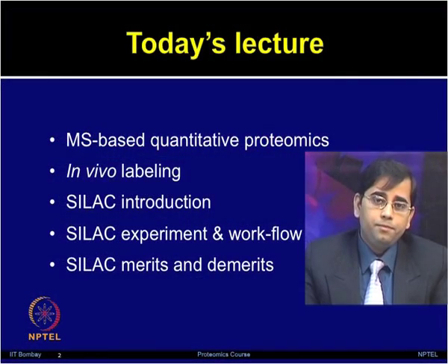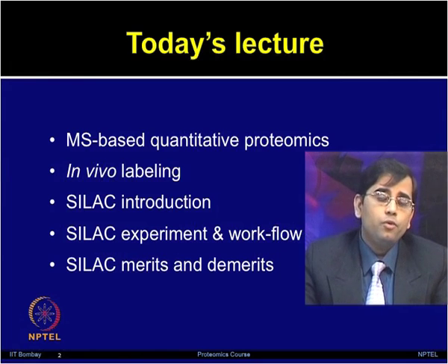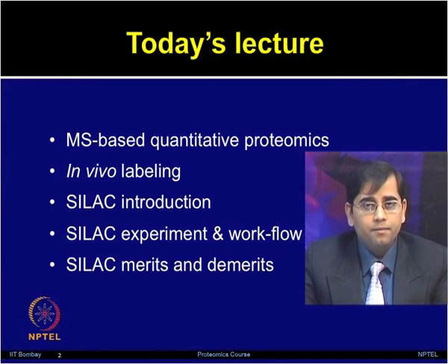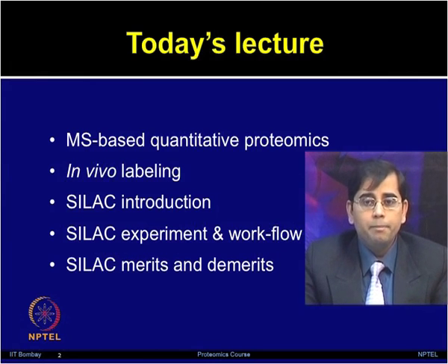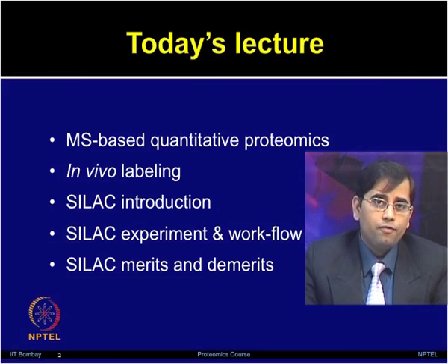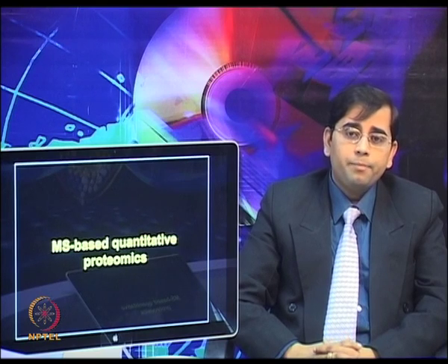So, in today's lecture, we will first discuss the MS based quantitative proteomics, in vivo labeling methods. I will introduce SILAC and then we will talk about the SILAC experiment and the step by step workflow. We will then discuss the merits and demerits of the SILAC method. So, let us start with the MS based quantitative proteomics.